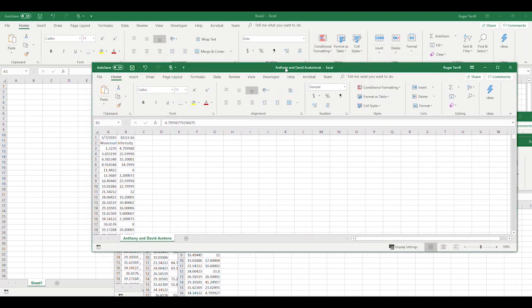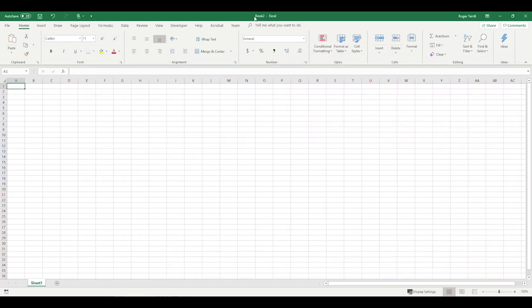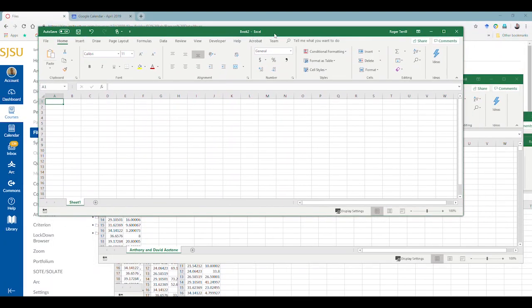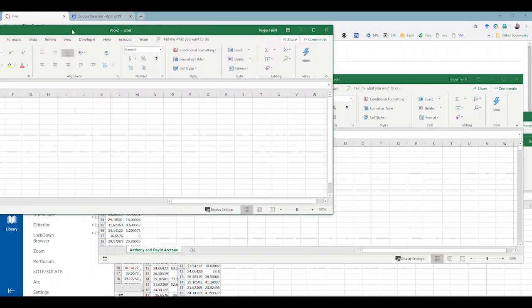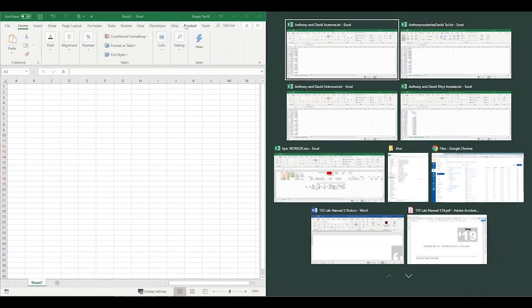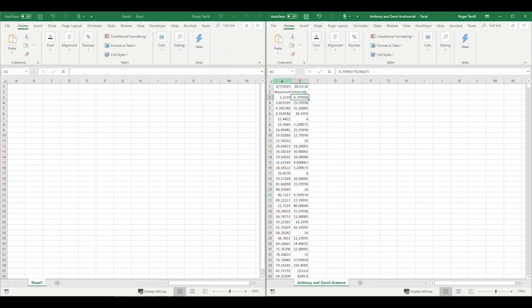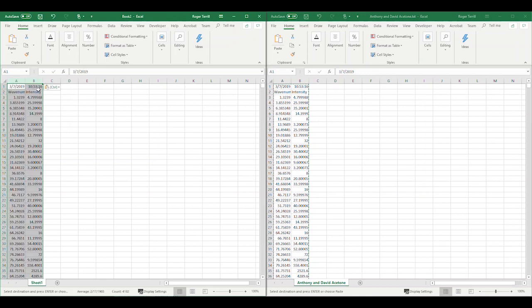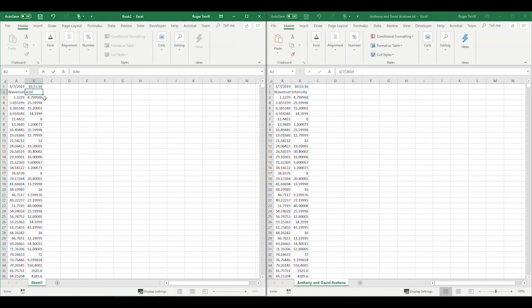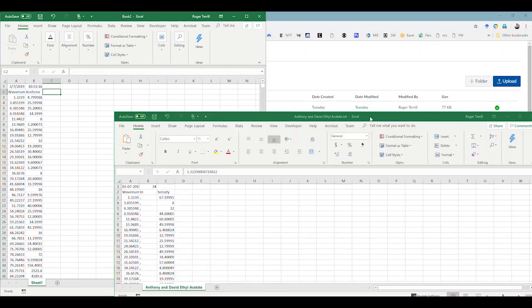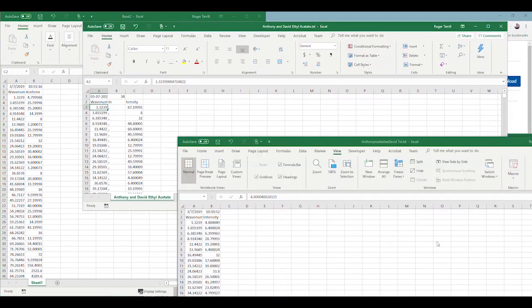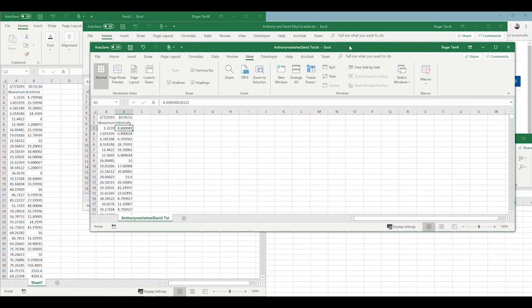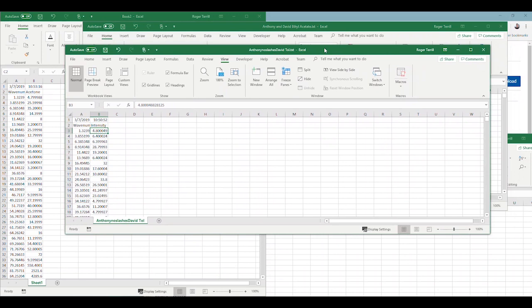So what I'm gonna do is I'm gonna transfer all these into this Book 2 over here. So here I'm gonna have all these folders, all these windows flying around here. Let's do acetone first. Let's actually take both these columns from acetone and we'll put them.